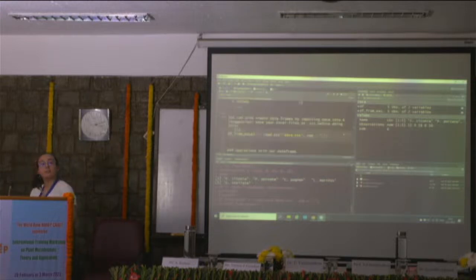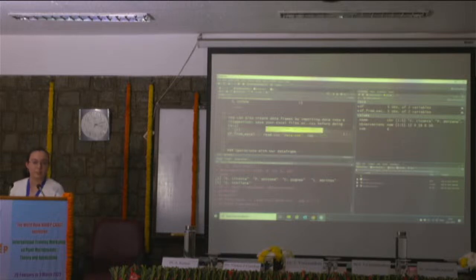So you can also import data from Excel or text files, any file based on text, into R. And what you have to do is use read CSV, that is a function. We know it's a function because there is a name and then parentheses right after. And you can see that the names are very descriptive. It helps you read a CSV, so that's good.